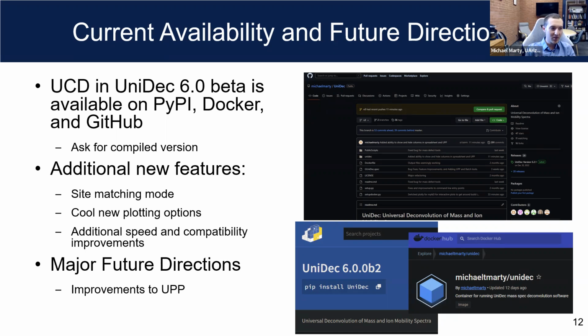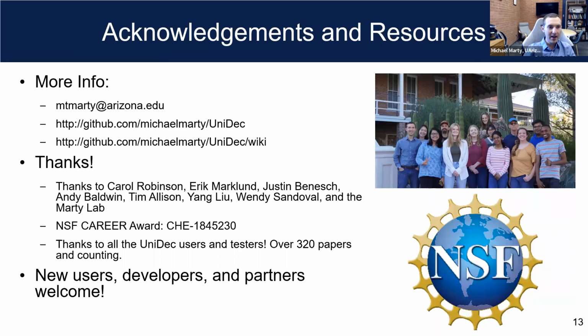So we're working on basically finishing up the UPP and seeing where it goes. With that, I'll thank my wonderful group and all of our funding and collaborators. Definitely the place to go is take a look at the GitHub site. We have a pretty extensive UniDec wiki page that's always expanding, and I have all of the hidden features in there. There's lots of little tricks that you can play. I'm always happy to get emails and hopefully answer pretty quickly. So that's the scheduled portion of the talk, and the rest, we can do whatever you want.